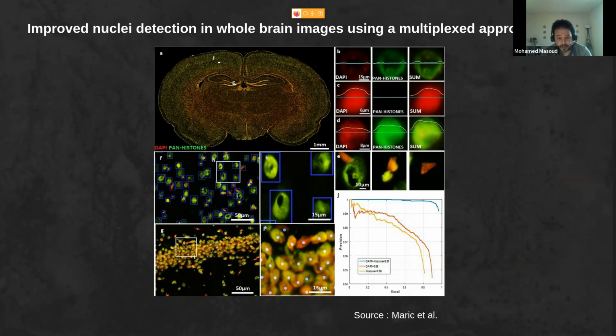The cells are very crowded, and it needs specific techniques in order to find a proper isolation between cells that are very close to each other.